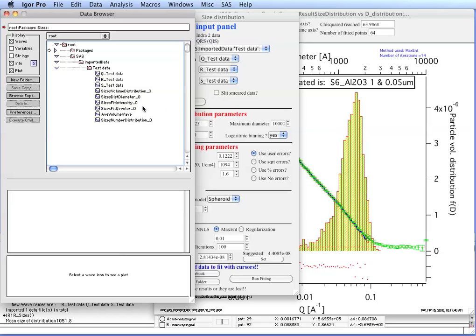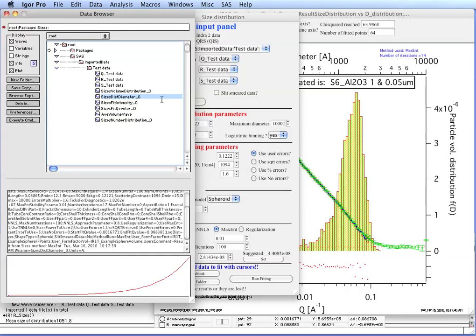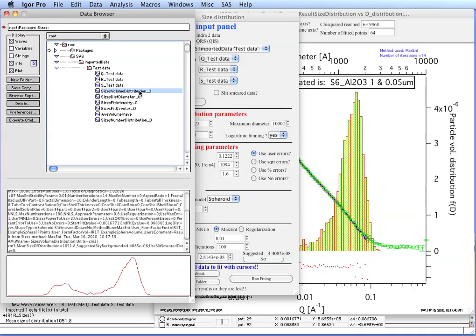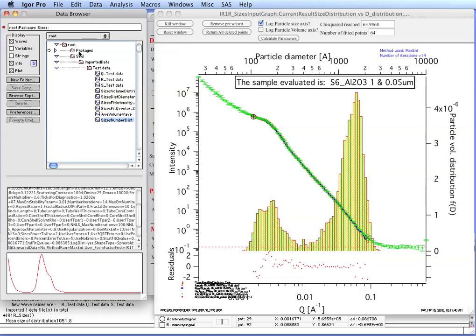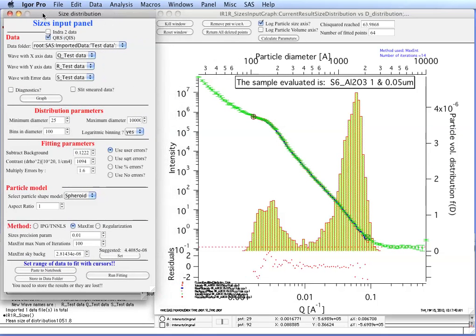They were the small angle scattering data. What the sizes now created is they created intensity and Q vectors. These are the fit for the data. These are the Q values and that's the intensity values calculated for this model. They also added a distribution of diameters and they then added 2 distributions. It's a volume distribution, which is what we actually see in this graph here. It's a number distribution, which is the volume distribution converted to number distribution by simply dividing each bin with a volume of a particle in that bin. So that depends which type of distribution you actually need for your analysis. So now that's available for us for some other analyses.